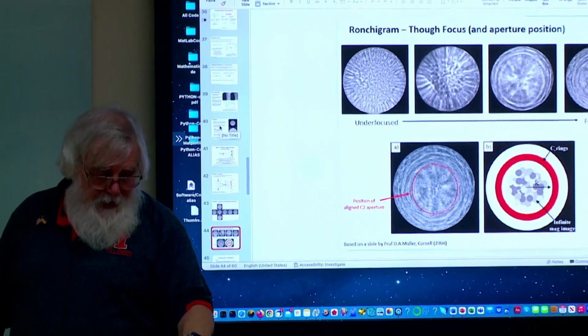It's hard to show it on photos. In a crystalline sample, you literally see dots, which are images of the atoms coming up. The only way to do that is to actually just sit down and do it. That's a good point. Maybe I should make a movie of that and put it in here. But there's no other way other than just sit, watch it, and go in and out of focus.